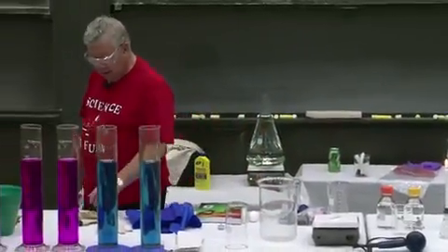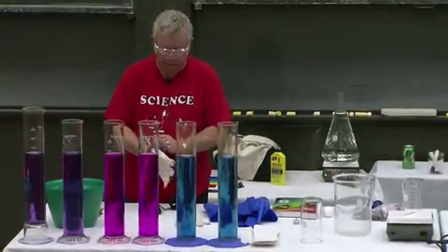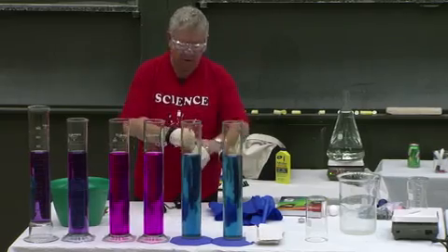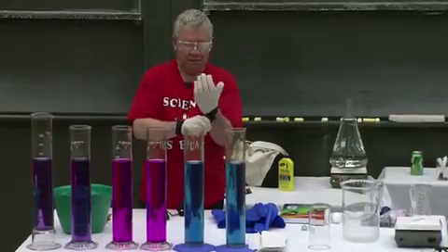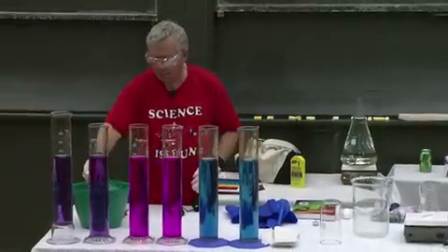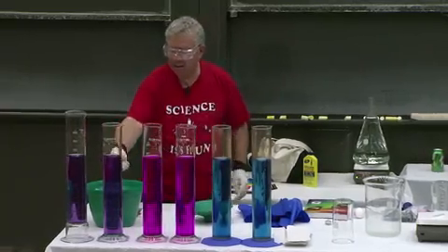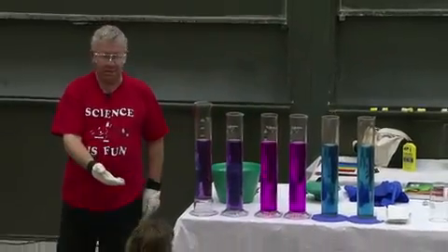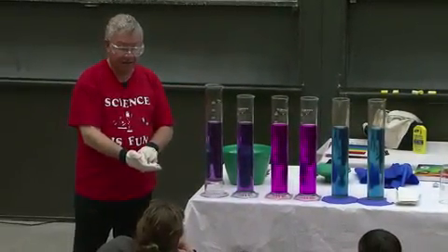Now what I'm going to do is an experiment using another form of carbon dioxide. It's called dry ice. Dry ice is solid carbon dioxide, and you'll notice I'm putting what on? Gloves, and I'm going to open this bucket and pick up 3 chunks of carbon dioxide solid. This is solid carbon dioxide. Its temperature is minus 78 degrees Celsius.